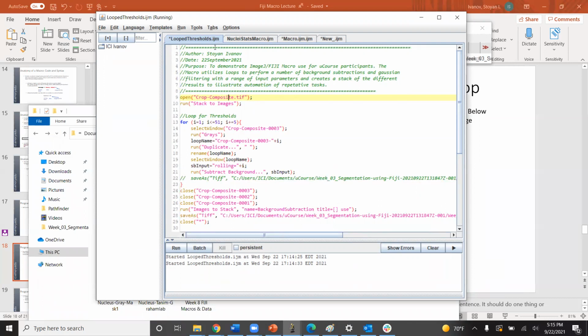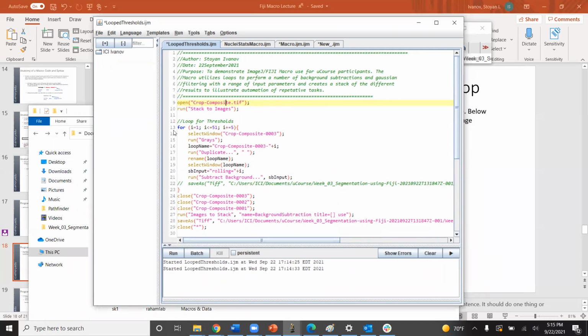That does make it tricky if you're moving from system to system, or if your file structure changes, but you know, it's something you're doing the first time. It's all right to do.